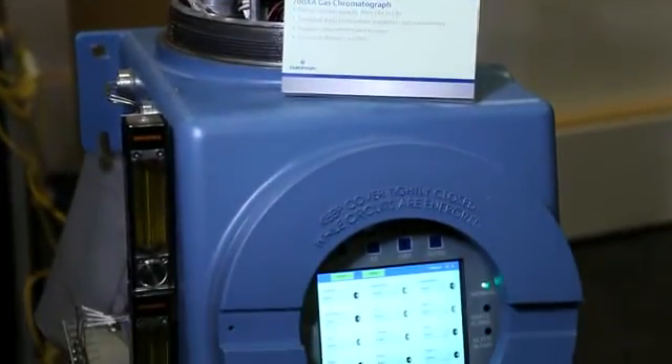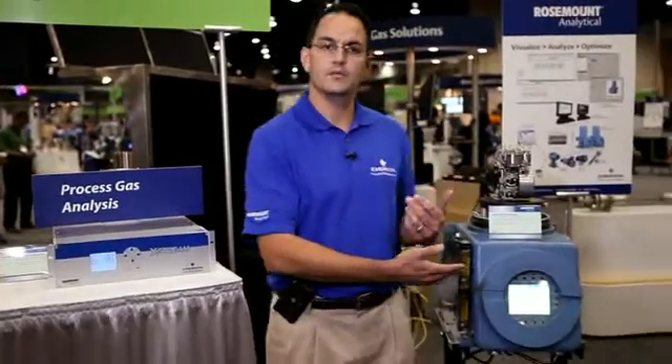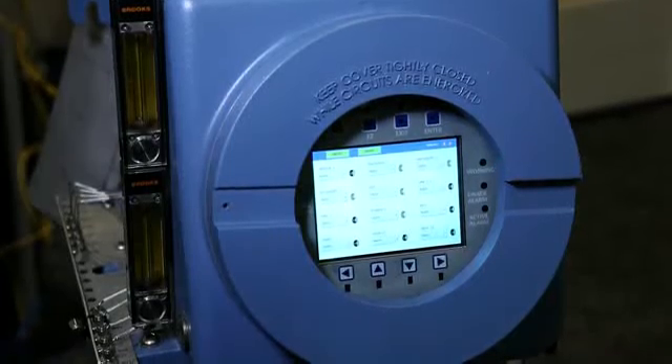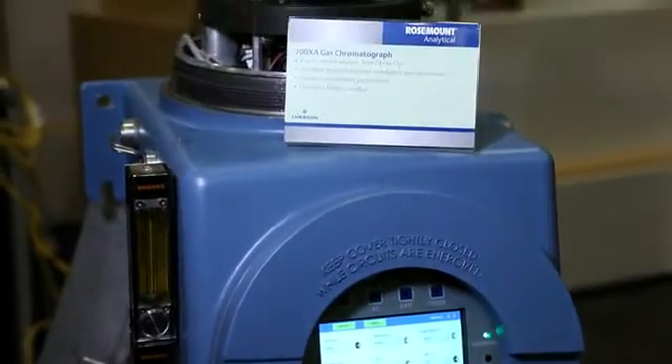Today I'm going to be talking about the Xtreme XE process gas analyzer, shown here on my right hand side, and on my left hand side we have the 700XA gas chromatograph. The 700XA comes in a very durable and rugged enclosure, all in explosion-proof housing.